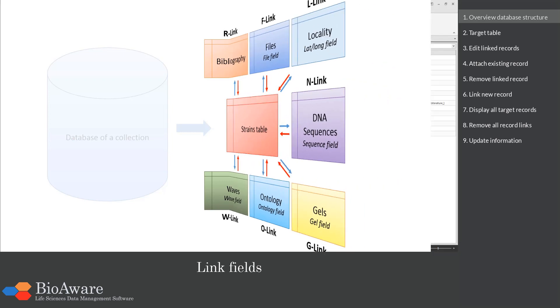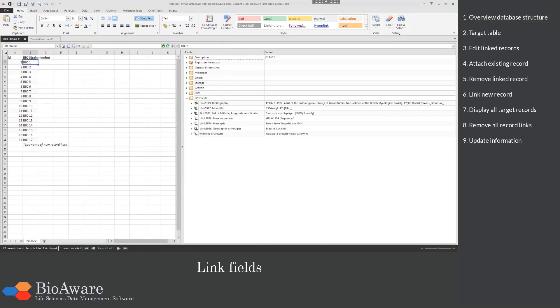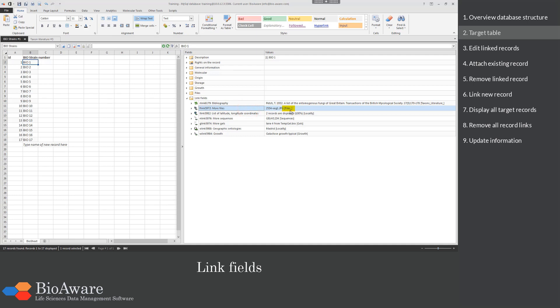So when we know this, we will now go to Biolomics. Here you can see all the link fields. On the right side you can see the name of the target table where the field is pointing to. The R-link field bibliography points to the table taxons literature. The F-link field more files is pointing to the records in the files table, and so on.